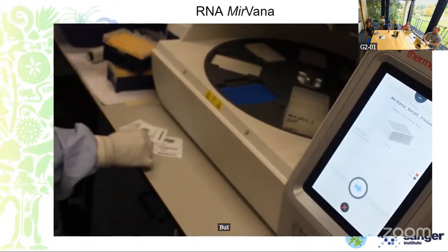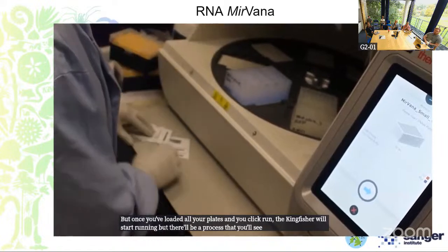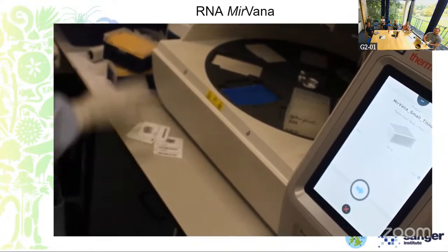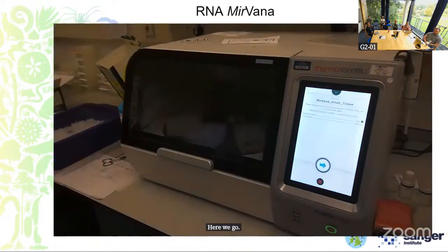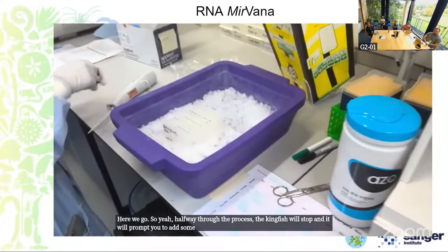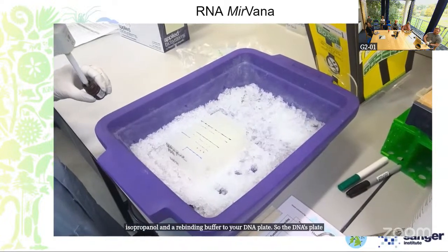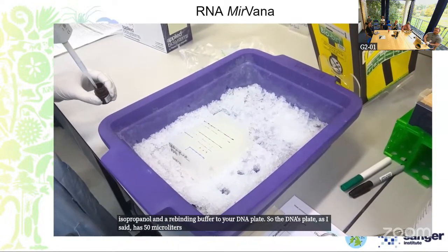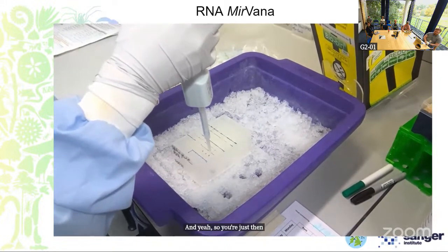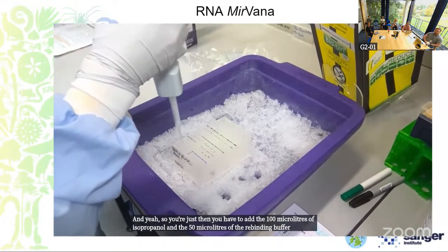But once you've loaded all your plates and you click run, the Kingfisher will start running, but there'll be a process that you'll see here in a bit where halfway through the Kingfisher will stop. Here we go. So yeah, halfway through the process, the Kingfisher will stop and it will prompt you to add some isopropanol and a rebinding buffer to your DNase plate. So the DNase plate, as I said, has 50 microliters within it, and this is made from a turbo DNase buffer and a DNase enzyme. And yeah, you have to add the 100 microliters of isopropanol and the 50 microliters of the rebinding buffer separately to each sample.